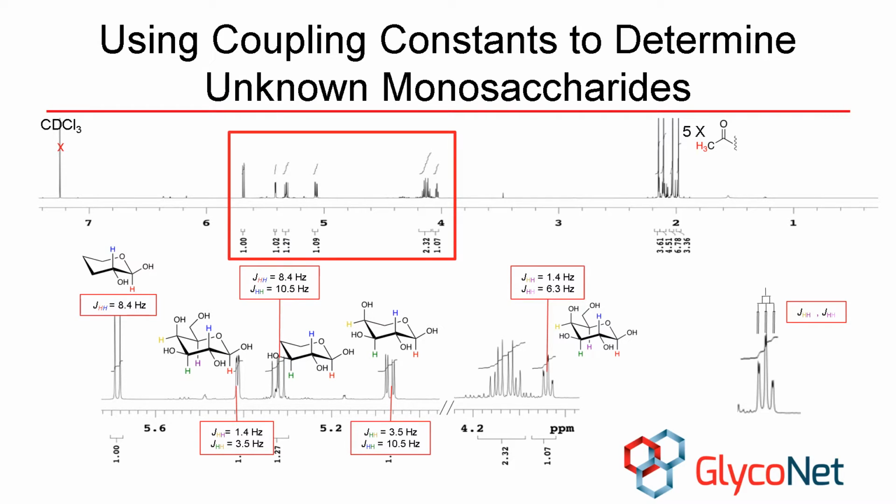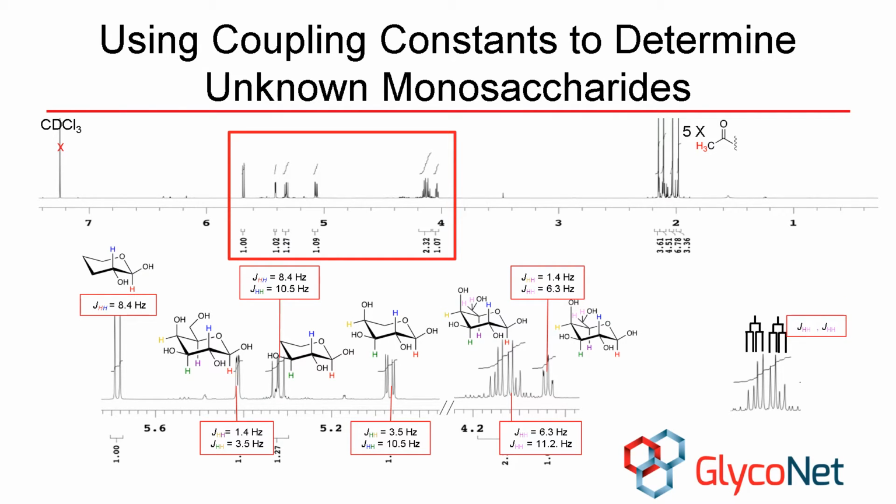With only the CH2 hydrogens at position C6 left, we know that the 6.3 Hz coupling constant is the interaction between the purple proton and the pink protons. The peaks due to the pink protons are both doublet of doublets. However, they are slanting towards one another due to their close chemical shift proximity. Sometimes this is called roofing or tenting of peaks.